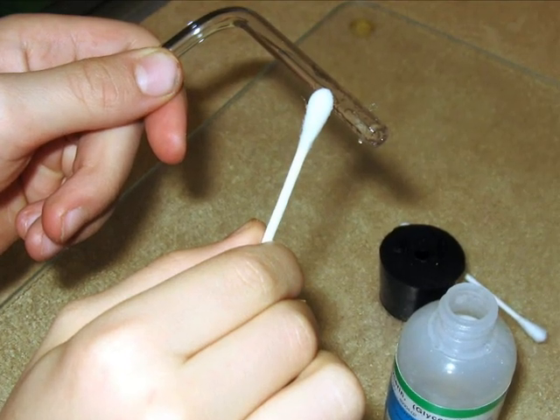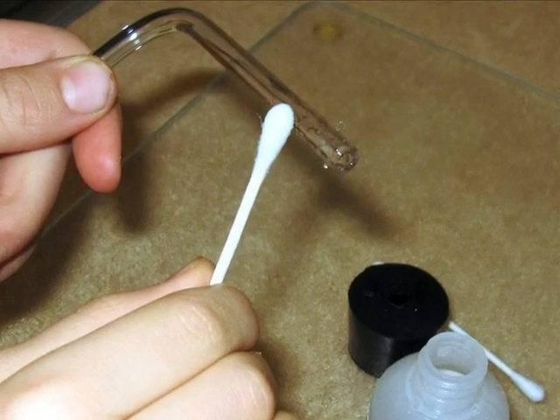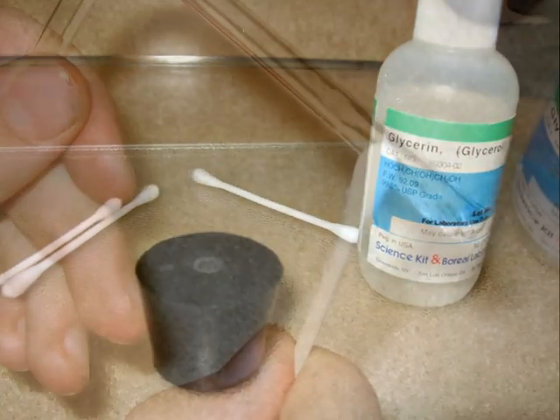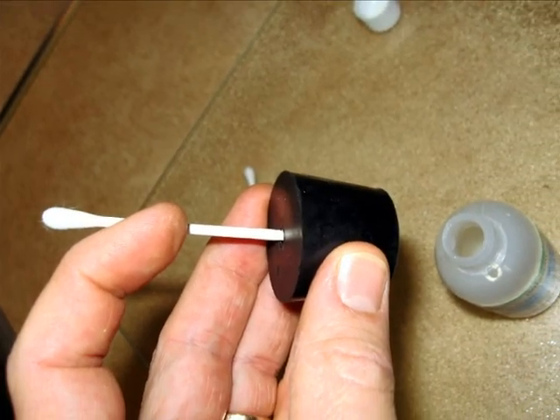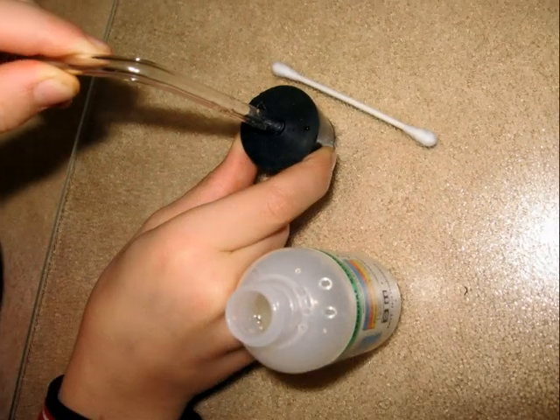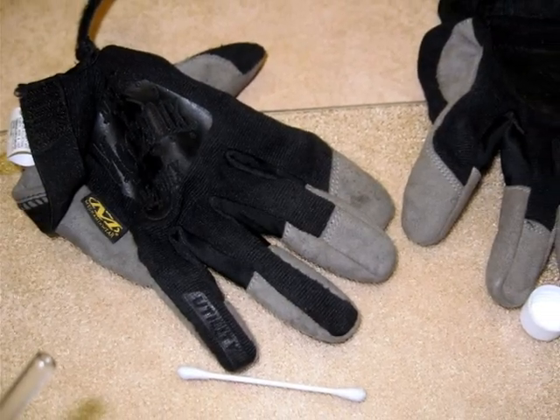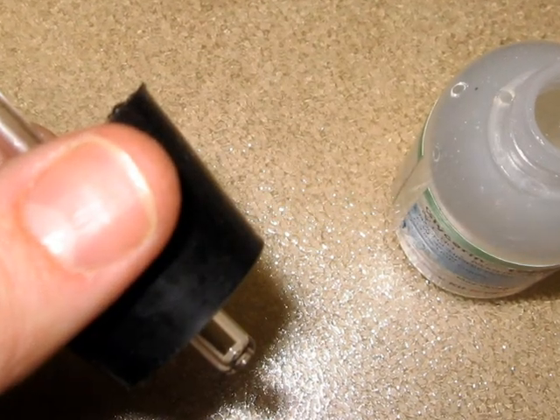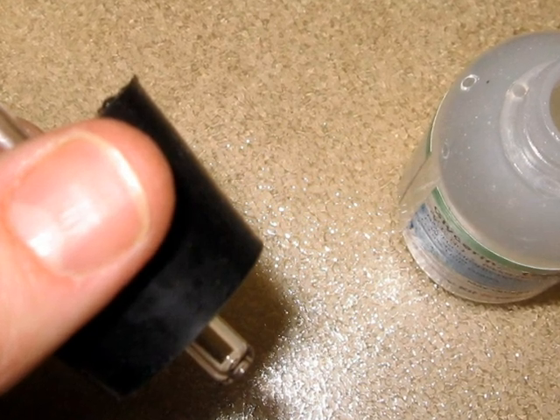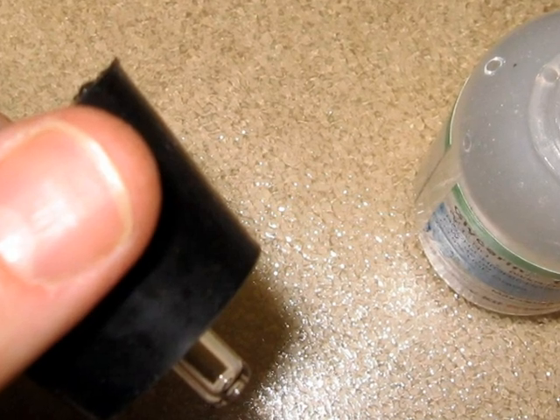Next, take your bent glass tube and lubricate the outside of it using glycerin. You will also want to put glycerin in the hole of the stopper. Then slide the bent glass tubing through the stopper. You will want to protect your hands with a towel or gloves. The end of the glass tubing should be all the way through the stopper, just extending from the end of the stopper as seen in the picture.